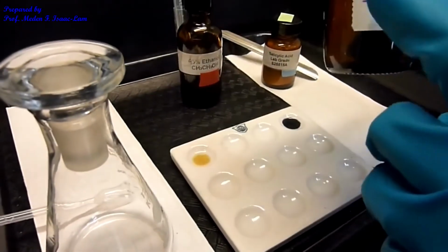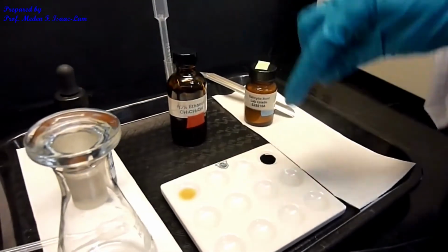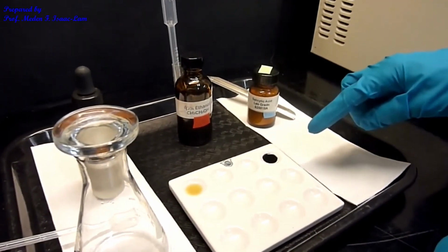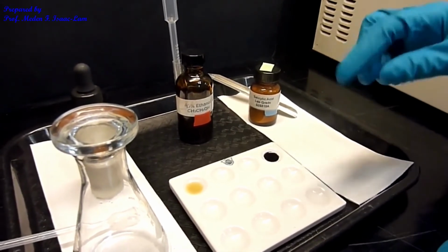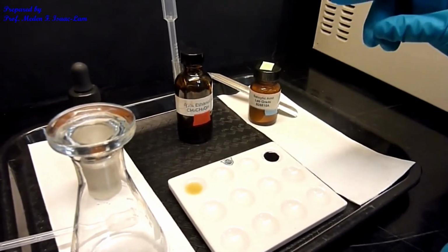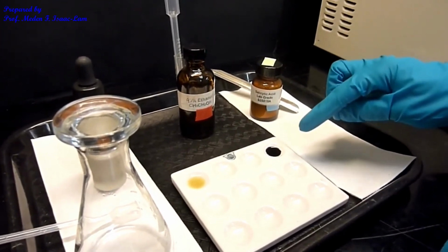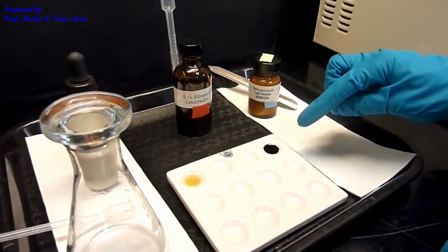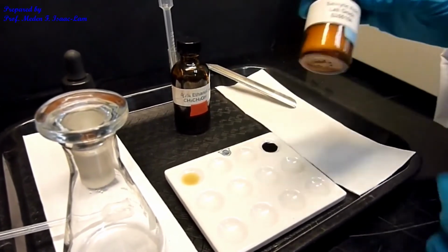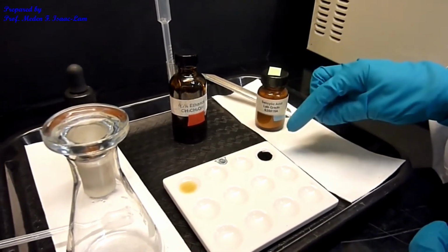So as you can see, the iron 3 will form a complex which is purple with compounds that contain phenol. So a benzene ring with an OH is a phenol, and then it forms a complex. That's why it's purple. That means that for the salicylic acid, because it still has a phenol, it will turn positive purple color.